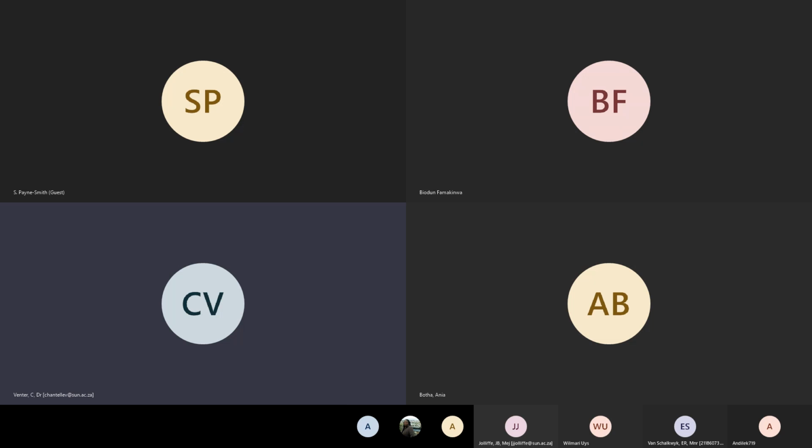For cell cultures, there are a few different techniques that you can do, and it doesn't necessarily involve preparing your samples by going through wax embedding or cryo embedding. Sometimes you can view your cells live, and if you have the correct microscope, you can use the phase contrast of the microscope to view the sample itself.